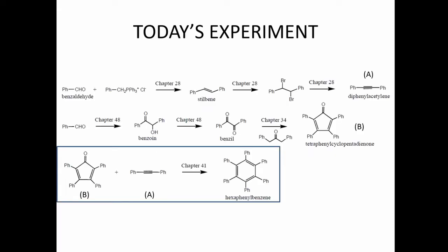Hello everyone, welcome to the final experiment of the Organic Chemistry Labs. For today's experiment, we're going to be discussing the convergent synthesis of hexaphenylbenzene. All of this information can be found in chapter 41 of your textbook, pages 435 to 440.